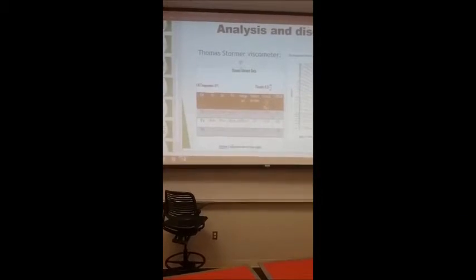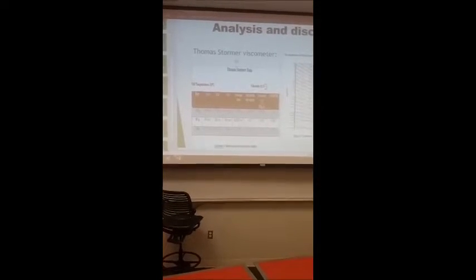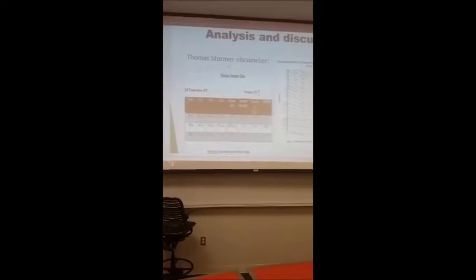Based on that, we used the calibration curve, which is this slide here. If you look at the right corner, we have a graph, the calibration curve for 25 gram, 50 gram, and 100 gram. So, knowing already what the average seconds to make 100 revolutions was, we came here and we were able to find for each of those average times the equivalent viscosity.